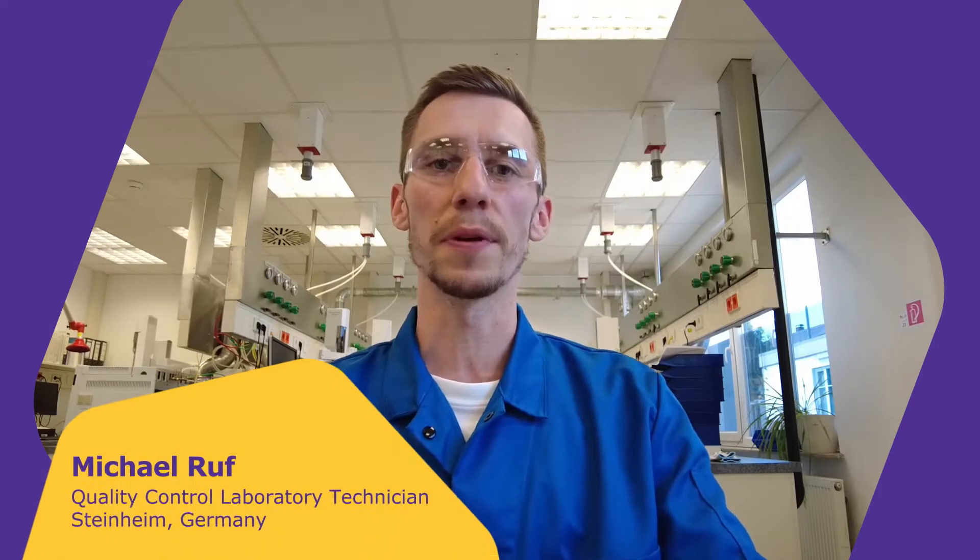I am a laboratory technician here in the quality control lab and I've been working here for three years. Our site is specialized on downfilling large quantities of chemicals into small portions for our customers all around the world. Over 1 million bottles are filled every year.